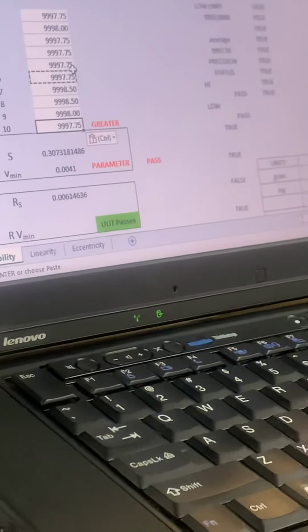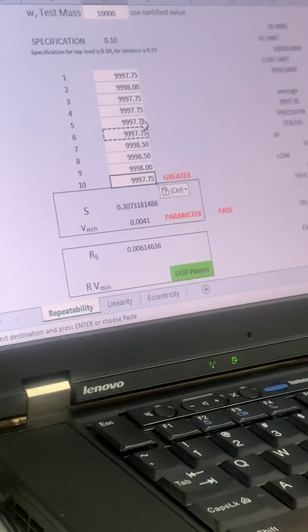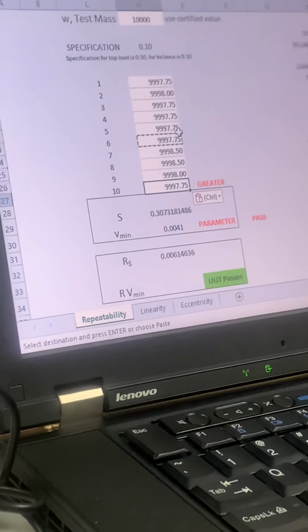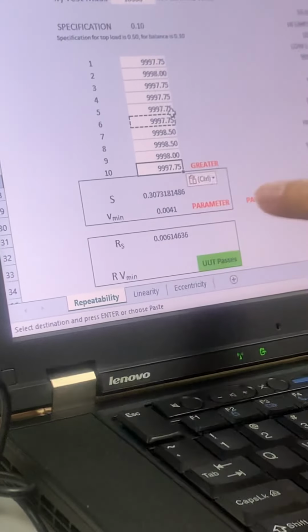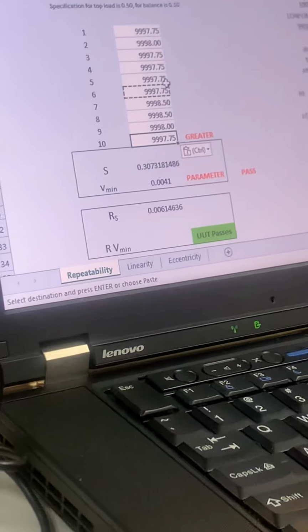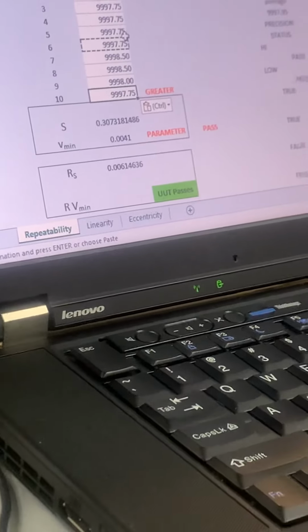And so you want to write down that repeatability test at 10 grams or 10,000 milligrams equals repeatability of 0.blah blah blah, times 2,000 equals minimum weight value of, and there's your minimum weight value. So you've got to at least put it in the notes. There won't be an actual data section for punching it in.